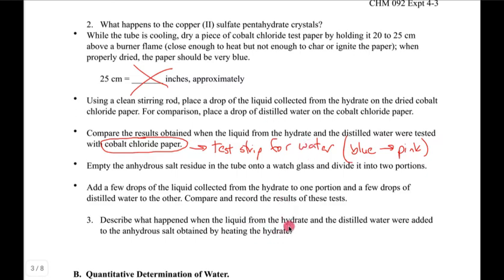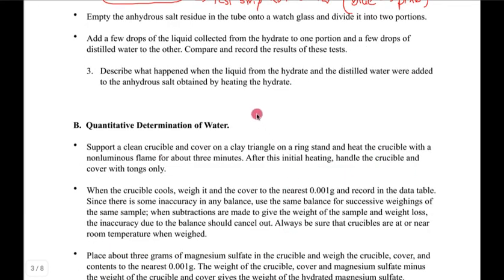And in the tail end of the video, you will see this. I'll add a bunch of water back to the sample. It may be hard to see. I'll go ahead and let you know that it is an exothermic reaction.